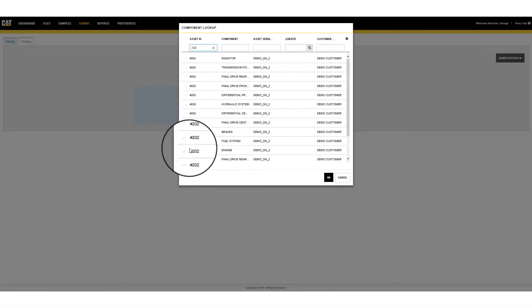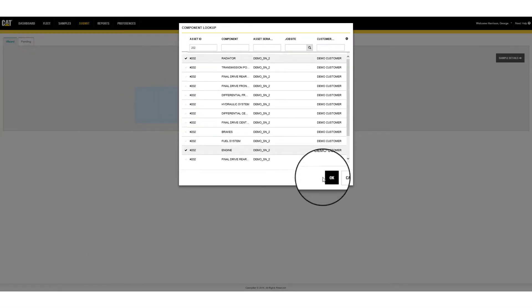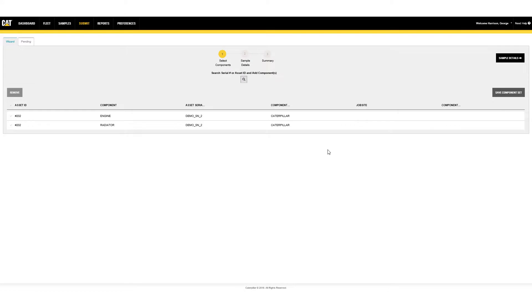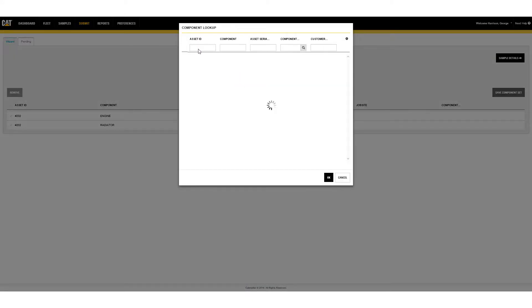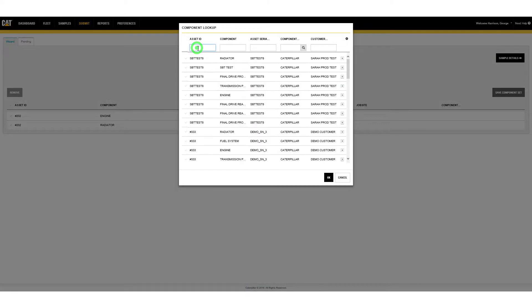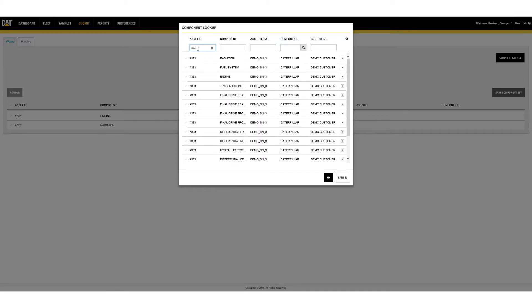Select the sample compartments and press OK. To add additional serial number compartments, click on the search icon again, enter the search criteria, select the components, and click OK when finished. Continue this process until all required components are added.